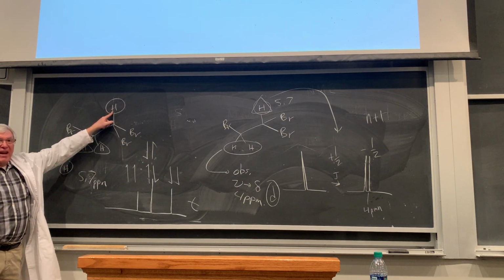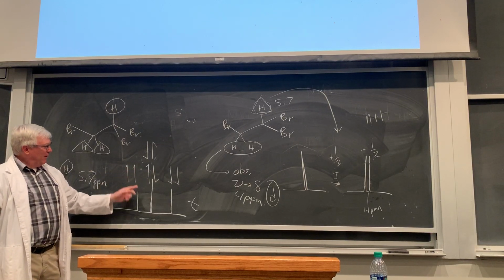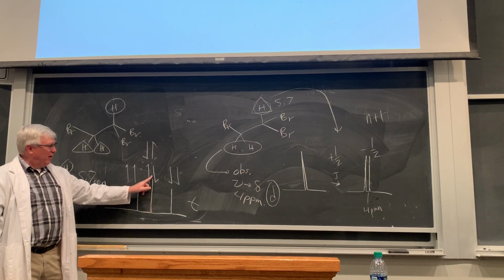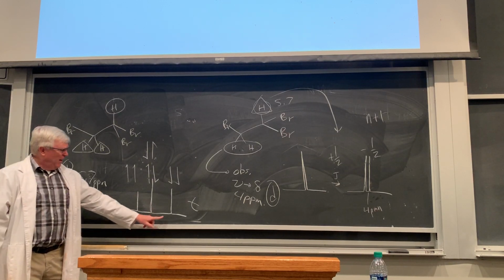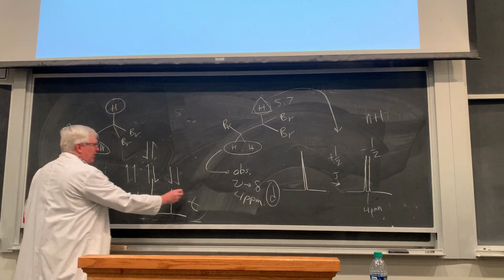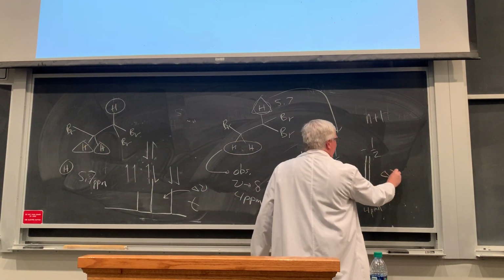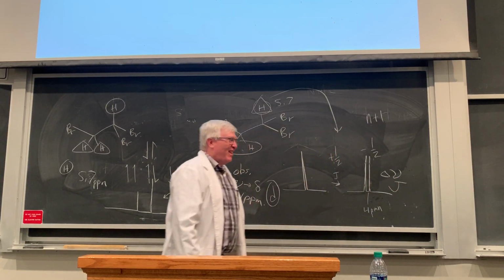We're observing this guy, and what we see are this spin array here. Spin up, up. You see that's adding to the magnetic field. Right here, we're canceling it out, right? But this inner peak is large, and that's centered right on where we expect the shift to be, 5.7. And then this one, they're both subtracting from it, okay? What do we call this distance right here? This little difference in the frequency. We had it over here in the doublet too, right? This little difference in frequency, we call that the J value for the splitting.